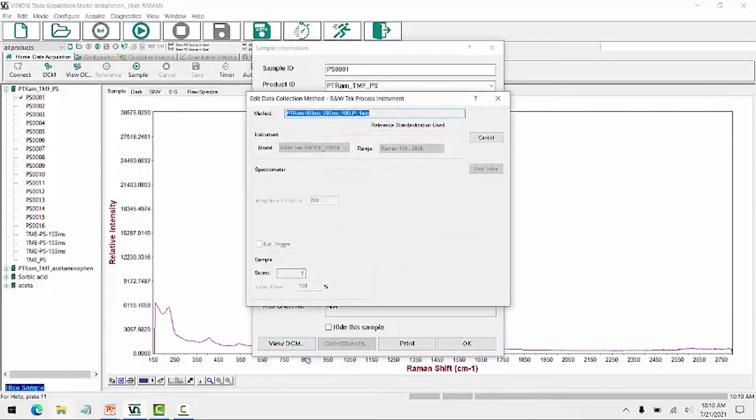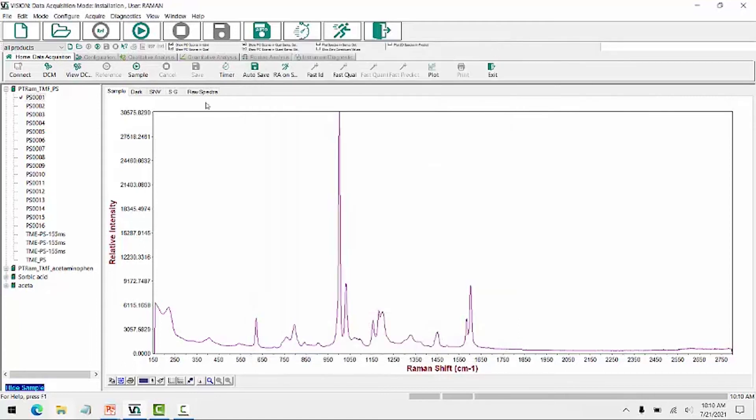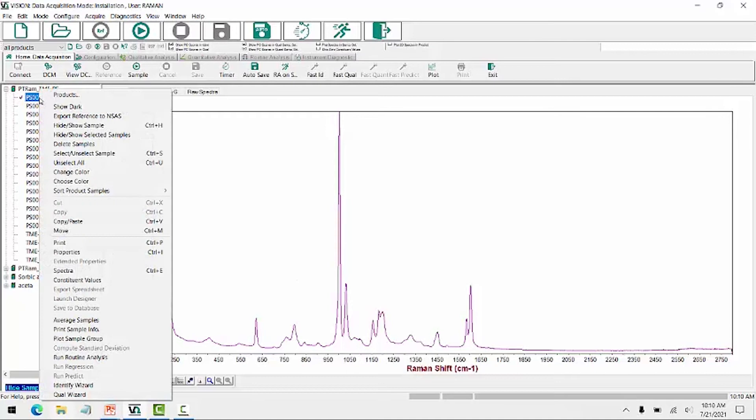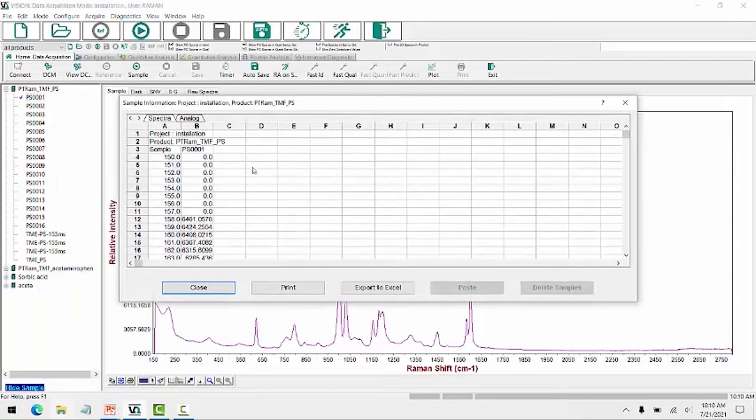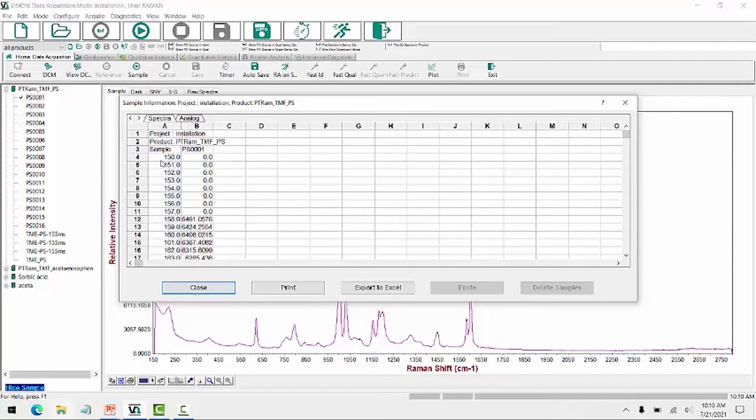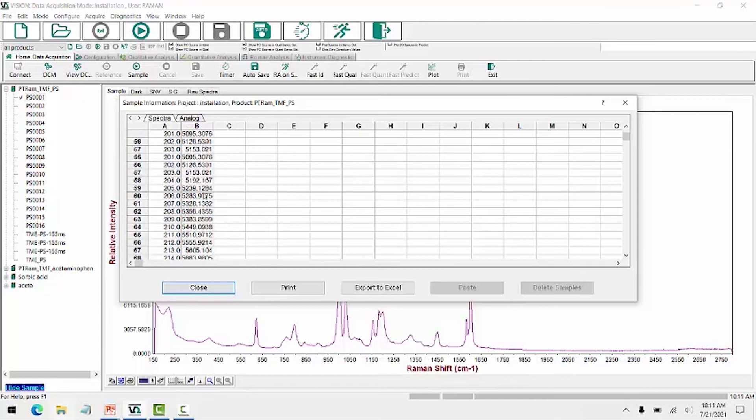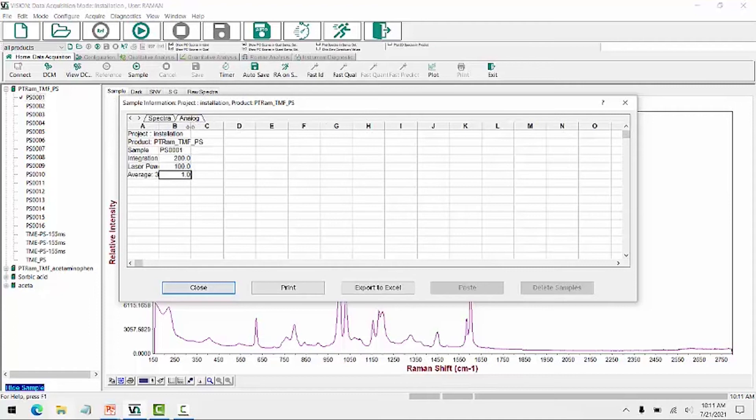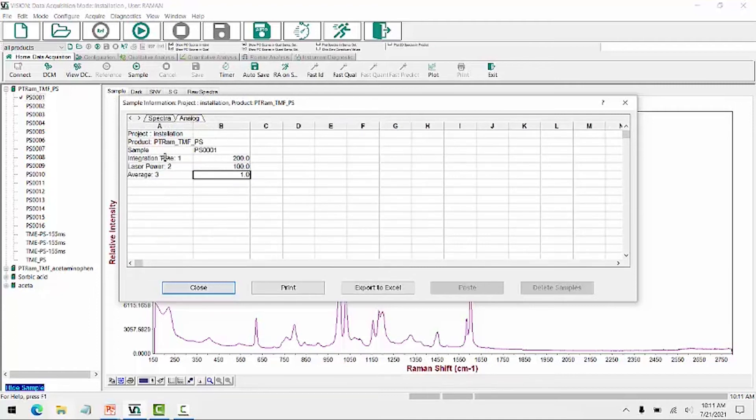The data collection method, the identifying serial number of the instrument. So viewing the DCM, we see that this is here for this previously collected polystyrene spectra that we're viewing. Another thing that we can view is the actual sample spectrum. So this is the display of the spectrum, but if we want to see the raw data for that, we can right-click and go to spectra. And here it's displaying the spectra in XY data, where X is your Raman shift in one wavenumber increments. And this is your relative intensity of your Raman relative intensity. Clicking analog, we see that it has the information on how the spectrum was collected with the parameters of the integration time, laser power, and the number of averages used.